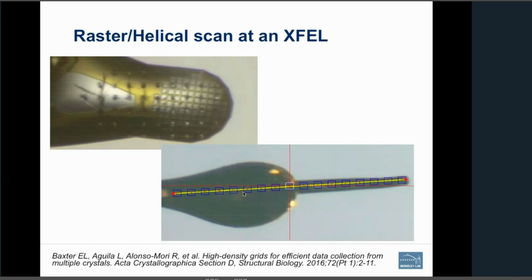Probably if I was going to do that today, then I would index each image separately and then do a joint ensemble refinement of everything together. But I think that there would be a way to parameterize DIALS in such a way that you could relate these using a rotation, but still use the mosaic and other still-specific algorithms to index and integrate the data. So the answer is yes. If this is a situation you find yourself in, let me know. I can provide commands to do it.